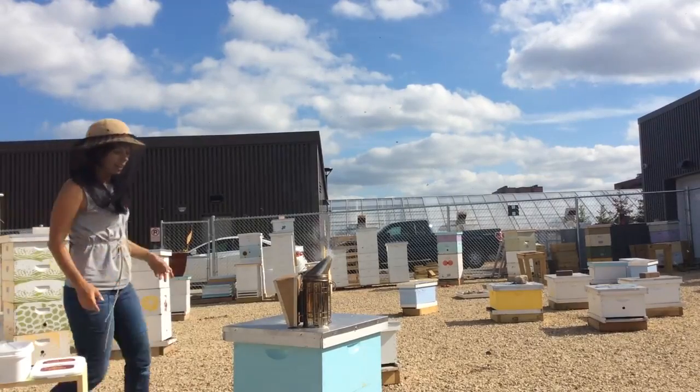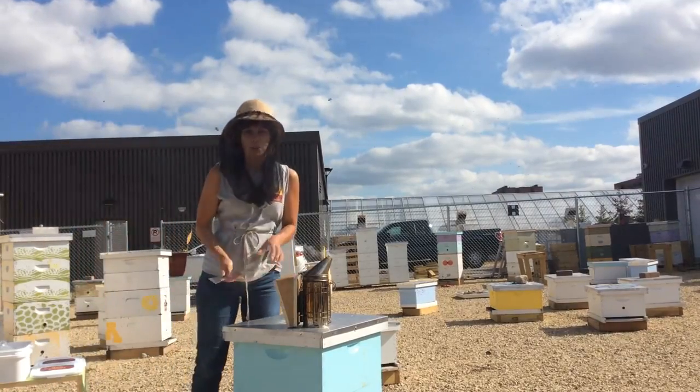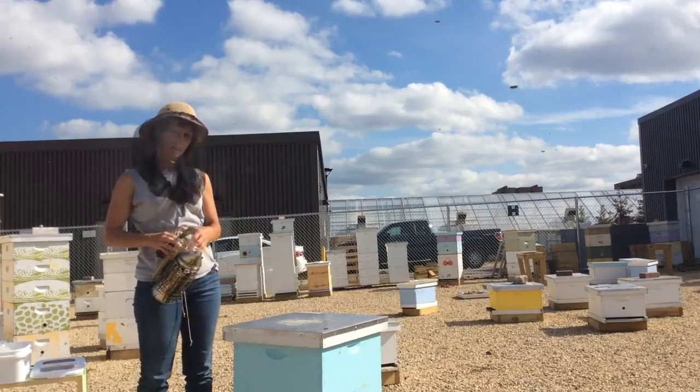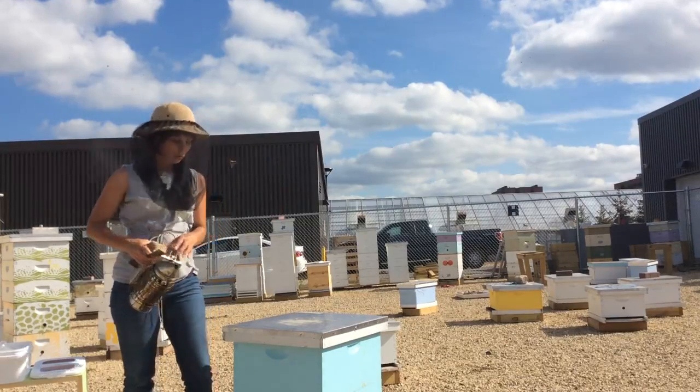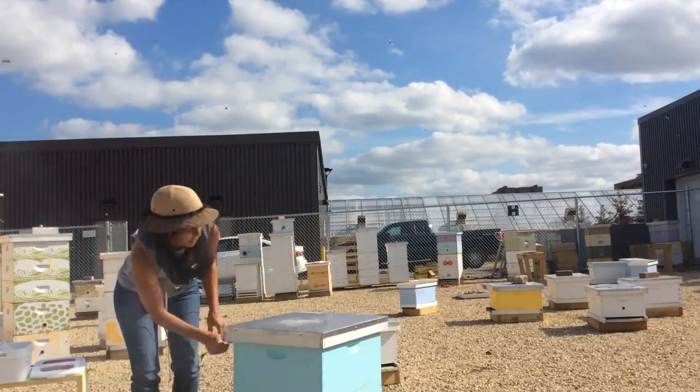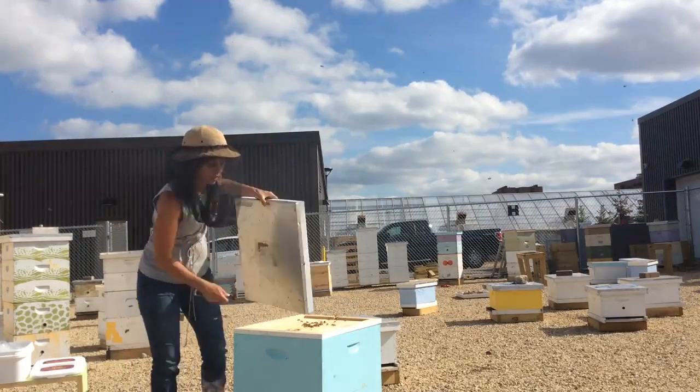Hi there! My name is Becky and I run the Bee Squad for the University of Minnesota Bee Lab. We are going to make mite monitoring fun again today. We're going to start and test this hive right here, and we're going to do a powdered sugar roll test.